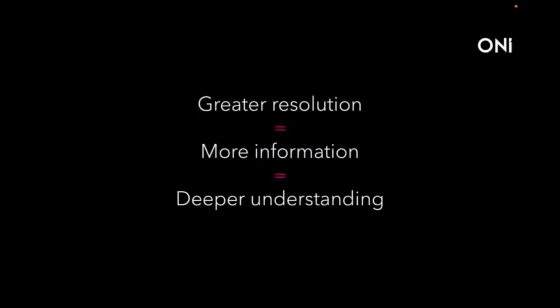Well, this is why: greater resolution doesn't just give you pretty pictures, it gives you more information. If you have more information, then you can have a deeper understanding of the processes that you're looking at. And there are many processes in immunology that are founded on things that happen at the nanoscale. We can look at them with a lower resolution and get a lot of insights, as I showed for the immune synapse with T cells. However, to really get to grips with what's fundamentally happening at a molecular level, we have to look at things at the nanoscale. And that's where super resolution comes in.